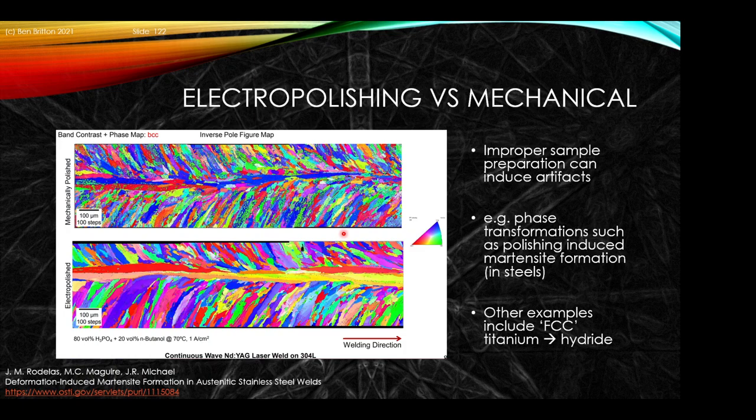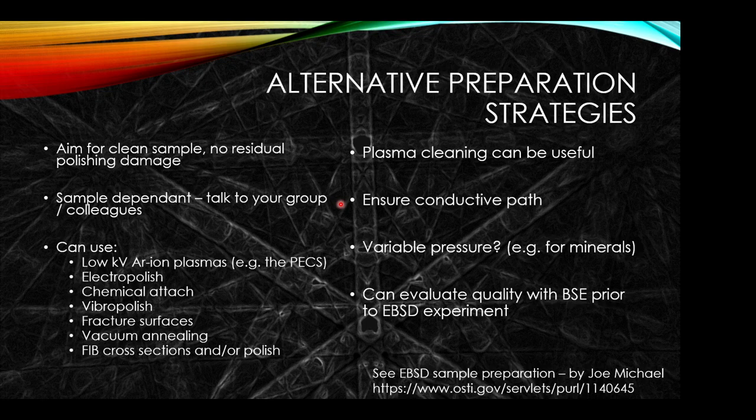Improper sample preparation can induce artifacts. This can produce things like sample polishing-induced martensite formation. You could get the introduction of hydrides that may look FCC-like in a titanium microstructure. You could also find that some phases are preferentially ripped out or pulled out of the material — you haven't retained a precipitate — or that one phase is preferentially polishing faster than another.